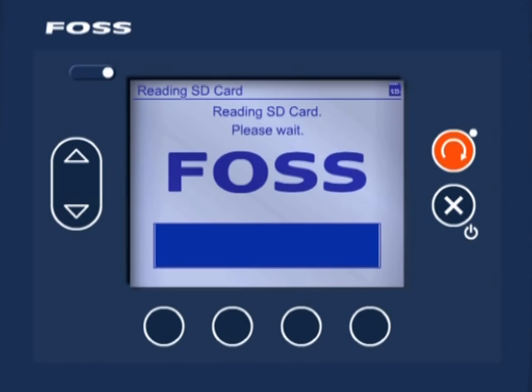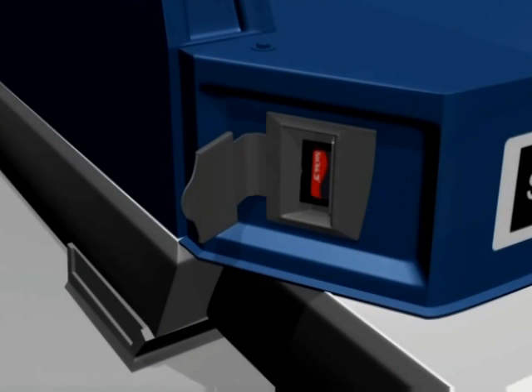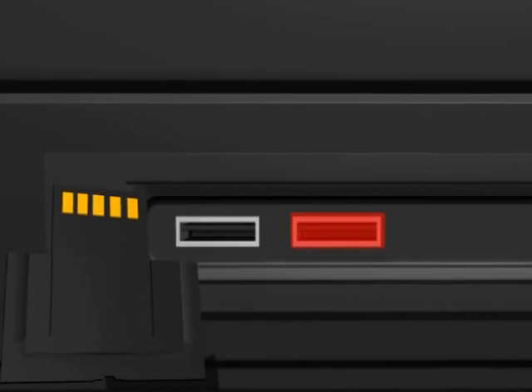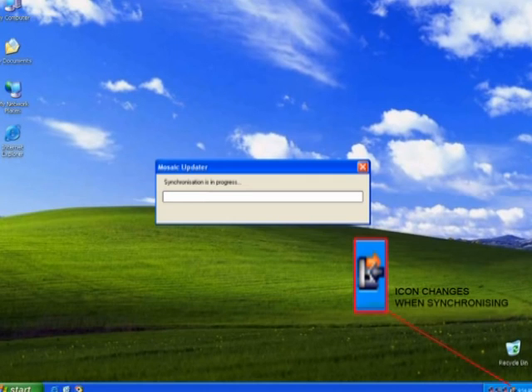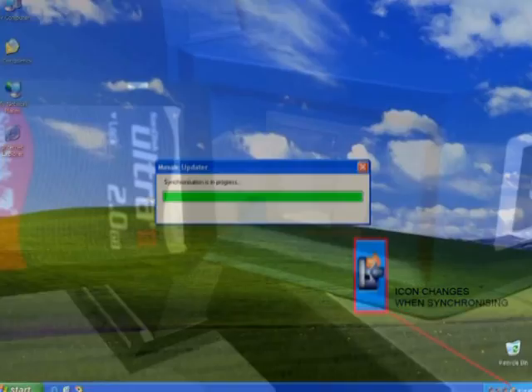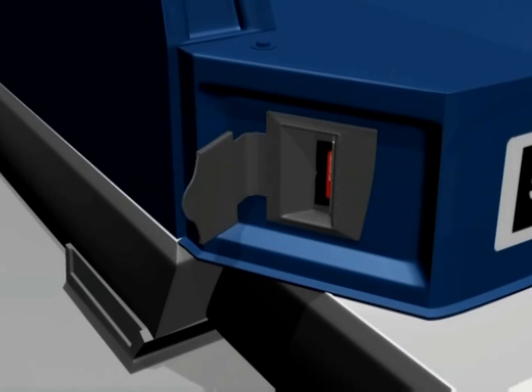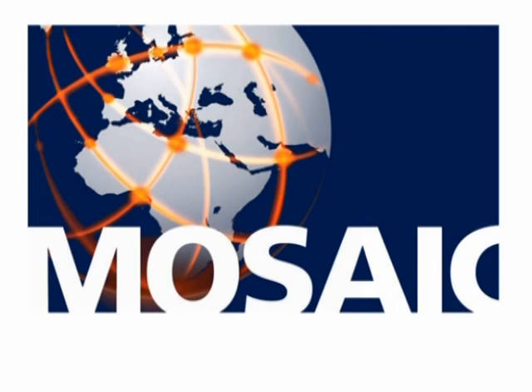To confirm that the download was successfully completed, remove the SD card from the instrument and reinsert it into the USB port of the computer. The synchronization will send the confirmation to the Mosaic server, completing the process. The SD card can then be returned to Infratex Sophia. All test results are uploaded to the Mosaic server, where they can be viewed and managed using Mosaic Express software.